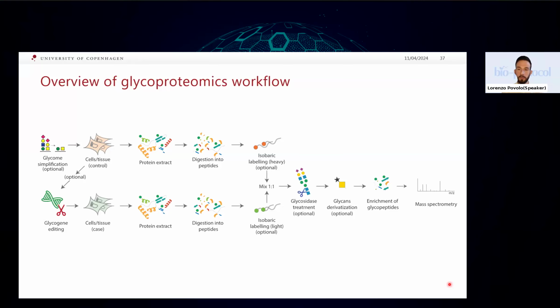Okay, thank you for your question. For the first part, I do not have direct experience with this protein, so I cannot specifically say what enzyme can be used. But a workhorse enzyme for the release and removal of N-glycans from a protein that I would recommend starting with is PNGase F, because generally it works on most N-glycan structures.